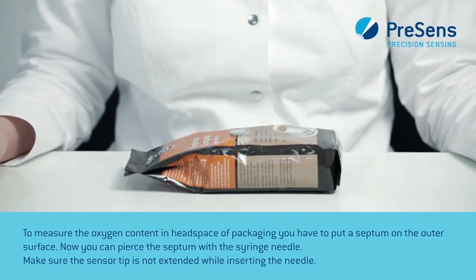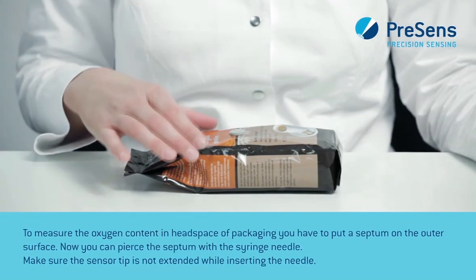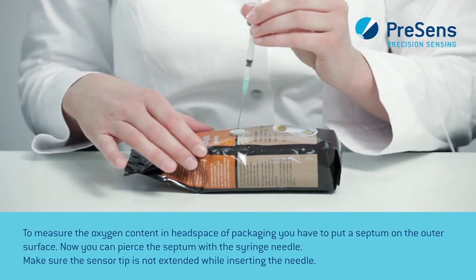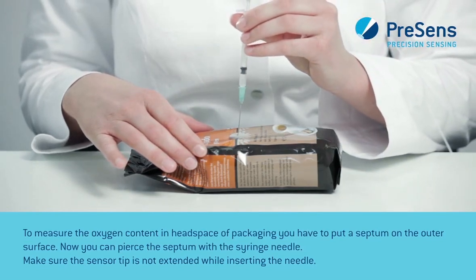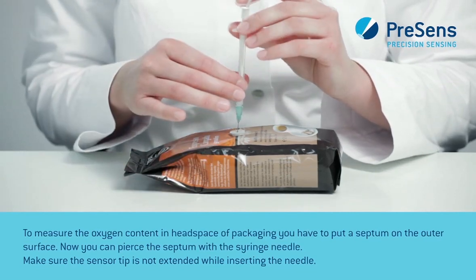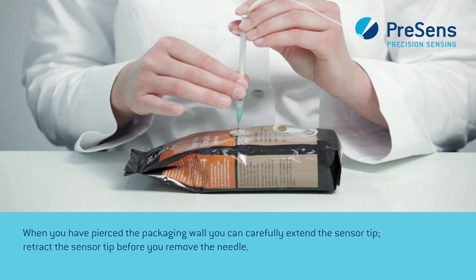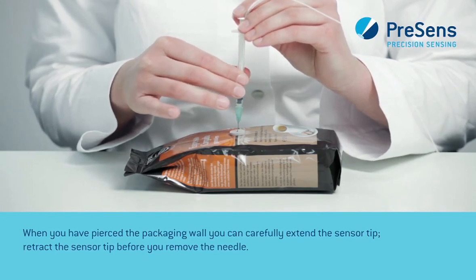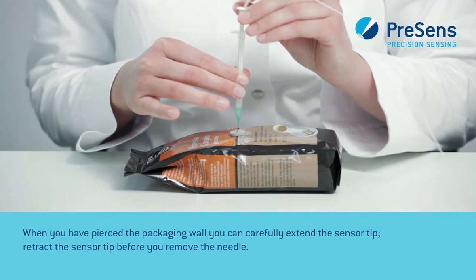To measure the oxygen content in the headspace of packaging, you have to put a septum on the outer surface. Now you can pierce the septum with the syringe needle. Make sure the sensor tip is not extended while inserting the needle. When you have pierced the packaging wall, you can carefully extend the sensor tip. Retract the sensor tip before you remove the needle.